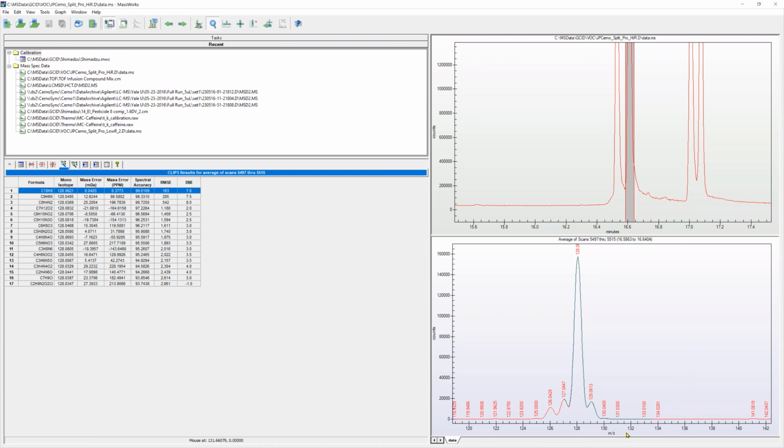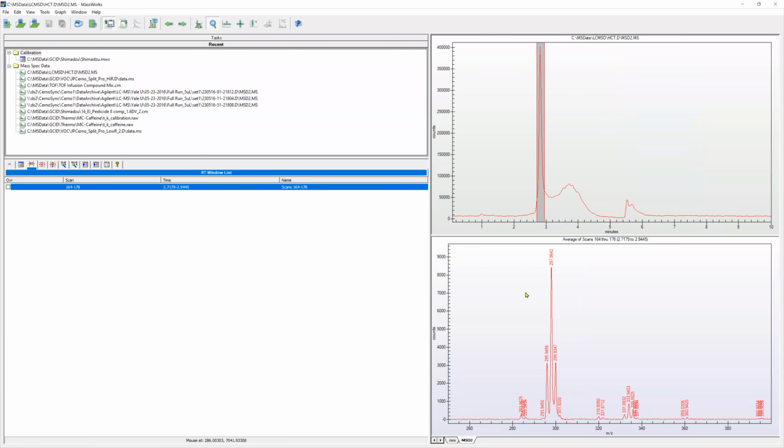So the point is that once we know what the line shape is, and since we can calculate mass spectra, we can easily look at mixtures and do all kinds of very interesting stuff that isn't even possible on a high resolution instrument. For example, let's look at this particular example here. This is interesting. This is actually a labeled compound. It's a drug. HCT is its common name. It's hydrochlorothiazide, and it's labeled with deuterium at one place on a ring, where 2 hydrogens can get replaced by 2 deuterium.